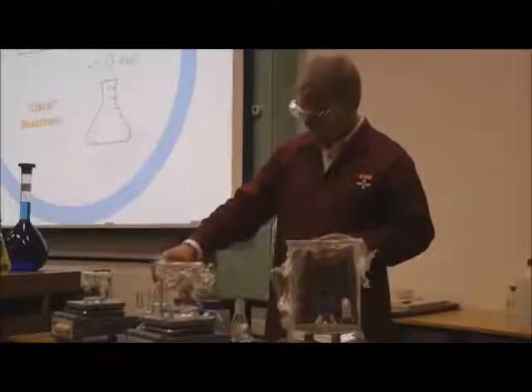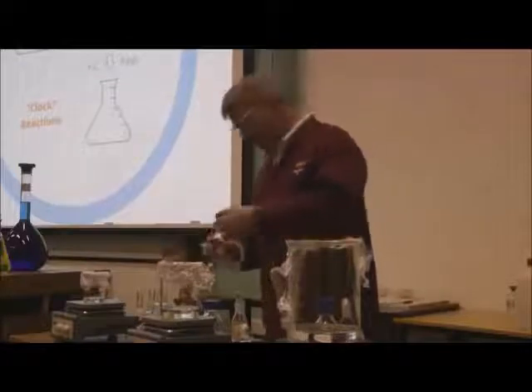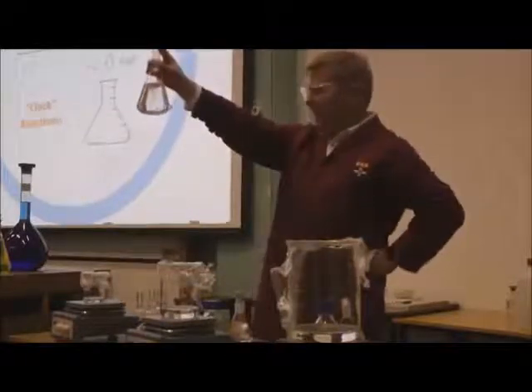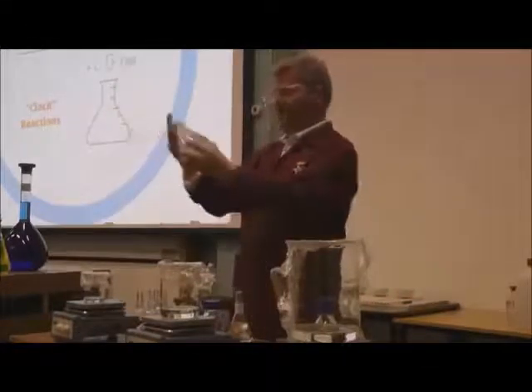Okay. So now we've got A, B, and C in here, and it should be reacting away. And very soon, hopefully, we should see a nice colour change develop.